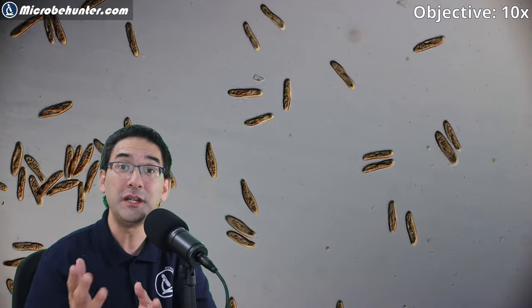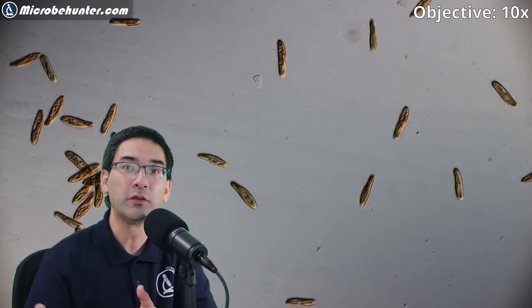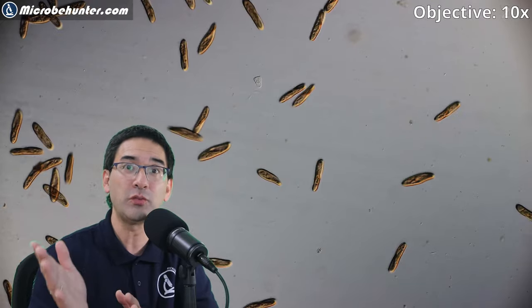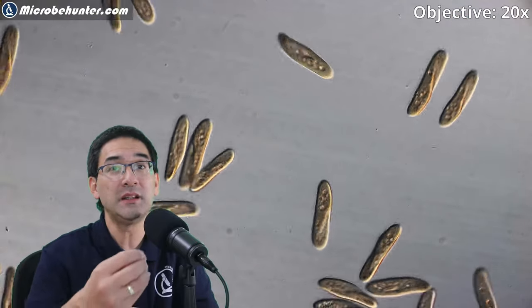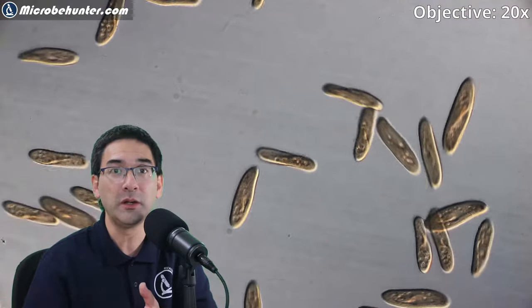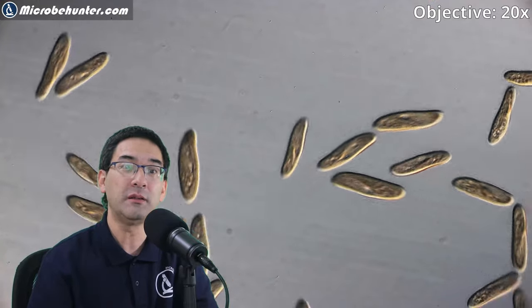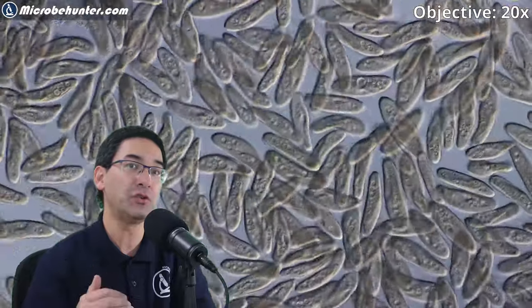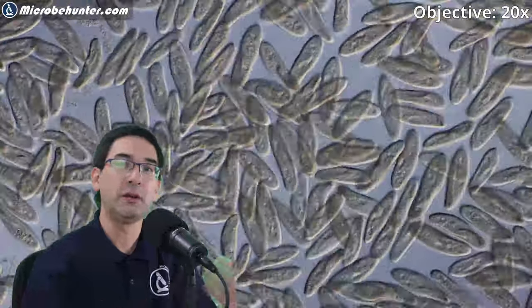I've taken a water sample, been breeding and growing them, and you can see here the normal movement — they move around in a more or less straight manner, and when they bump into an object they reverse direction. That's normally what they do. Even at a higher density you can see they start to move around in a very normal way.